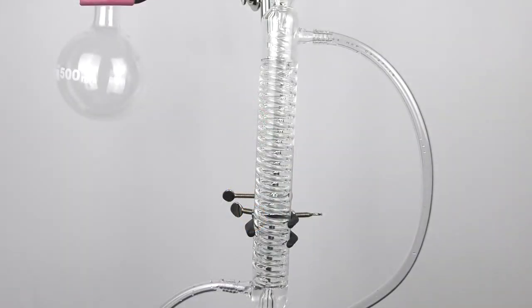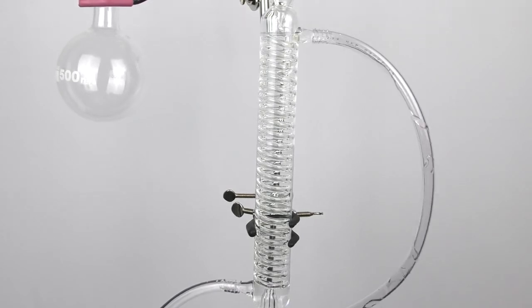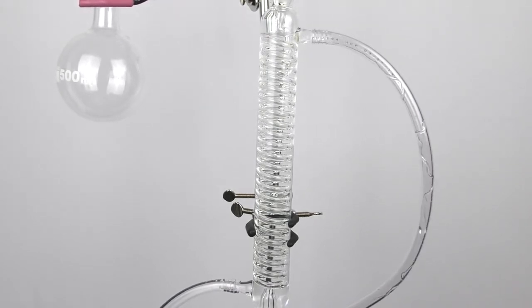For a cooling system you have a variety of choices. You can simply use flowing tap water at the cold water faucet in your lab to go through the condenser.